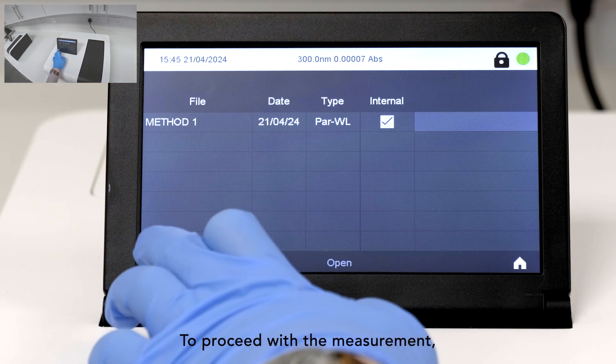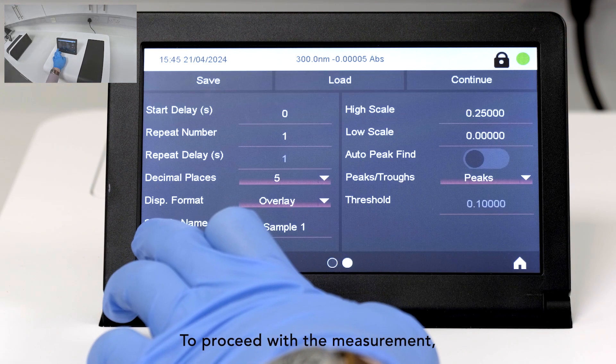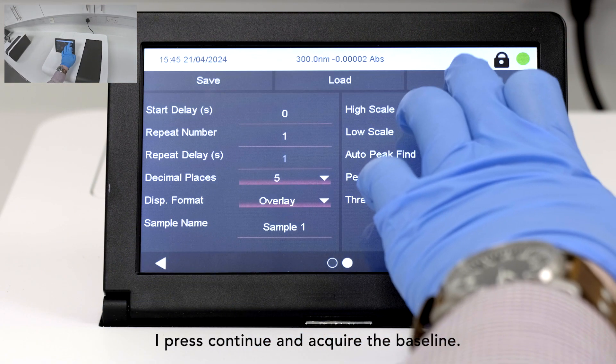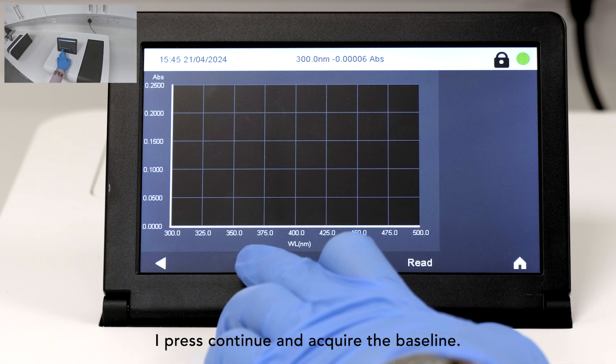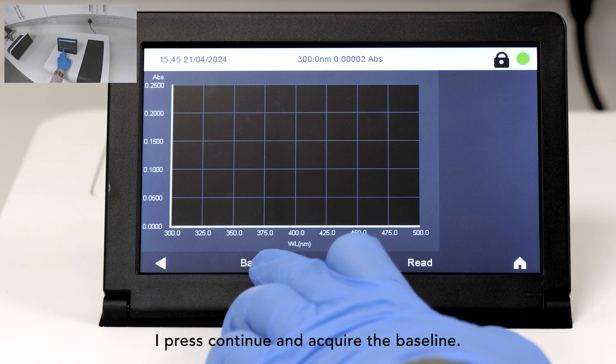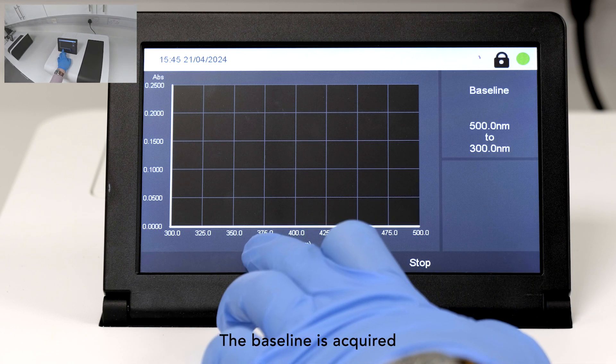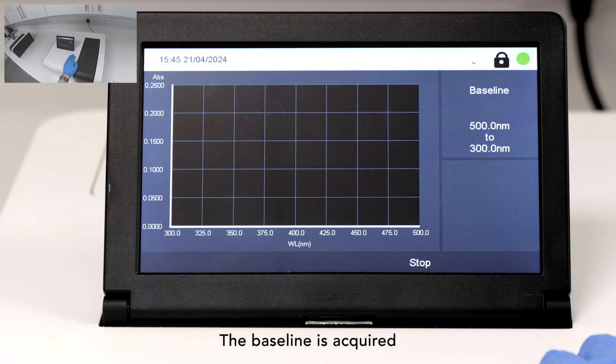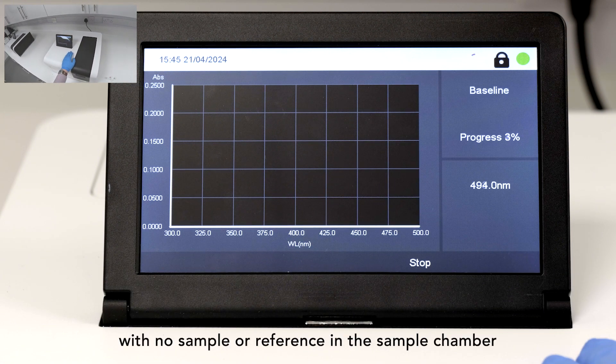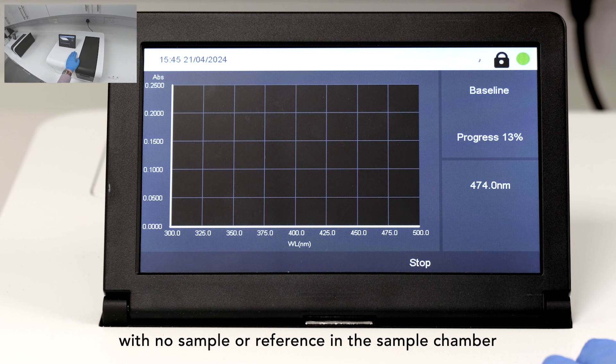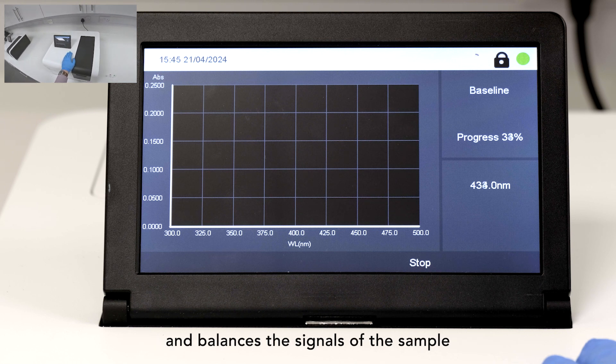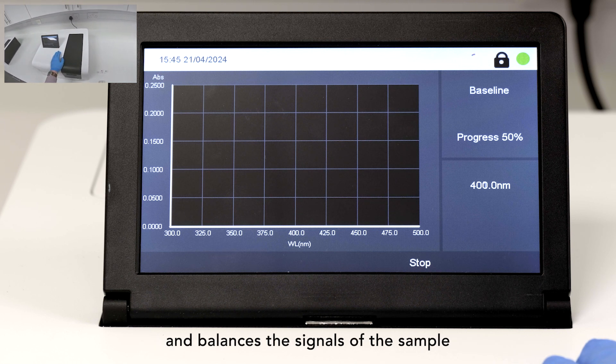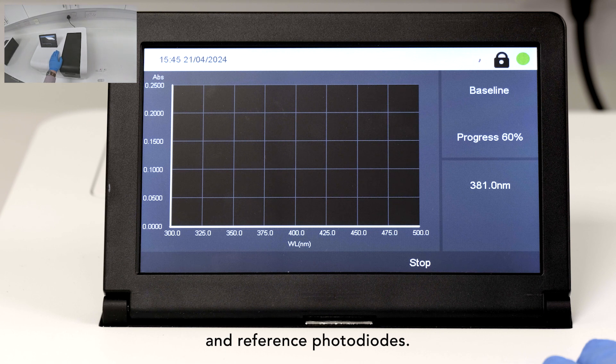To proceed with the measurement, I press Continue and acquire the baseline. The baseline is acquired with no sample or reference in the sample chamber and balances the signals of the sample and reference photodiodes.